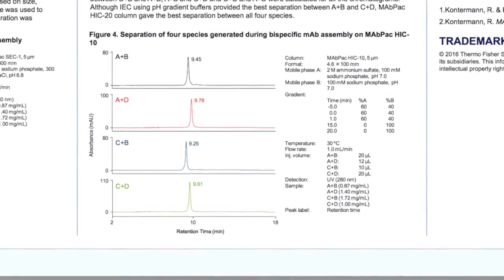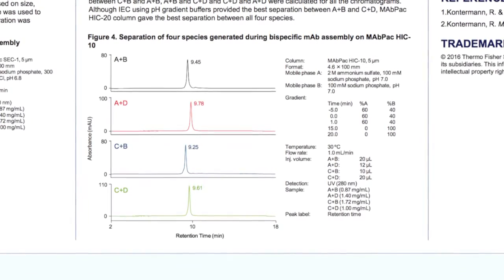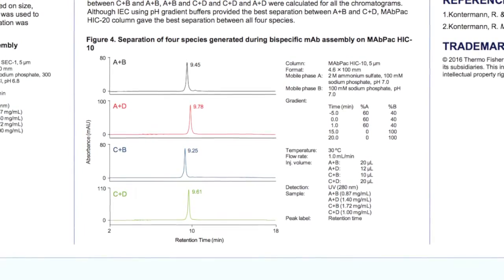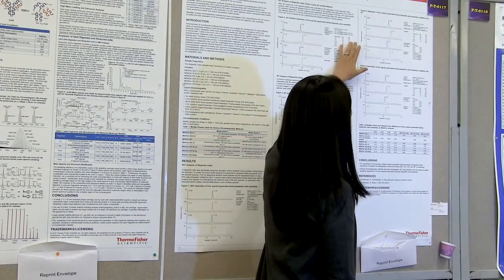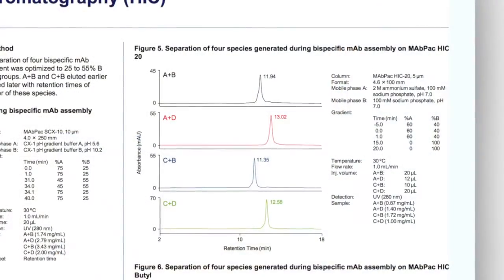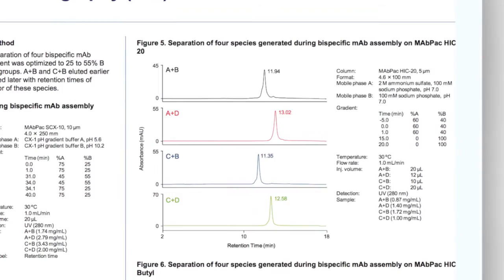We first tried the mAbPac HIC-10 column, which has a polyamide functional group as the stationary phase. And here, we weren't able to see a good separation. Then we tried our mAbPac HIC-20 column. It also has an amide group functionality. However, the surrounding chemistry is slightly different.